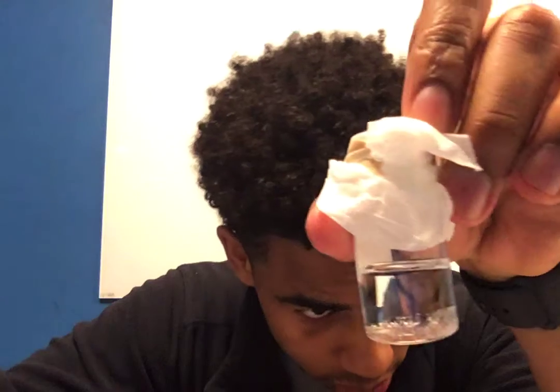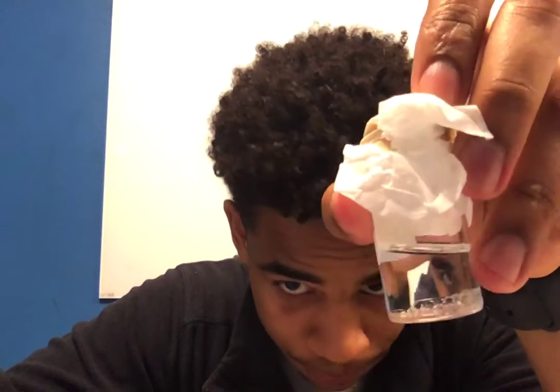Since my last video, there's been a little bit of crystal growth. There have been a couple smaller crystals that have formed on the bottom. The larger crystals haven't really changed much. They still remain the same size and have relatively the same qualities. They're pretty transparent and clean cut still. There has been one change, as I've noticed a couple of the larger crystals have started to conjoin to form a larger crystalline structure.